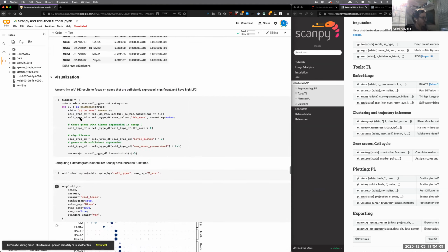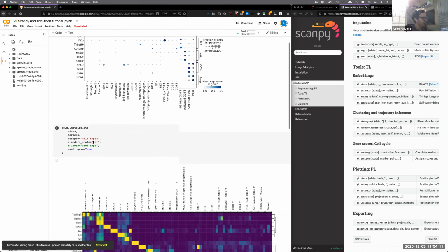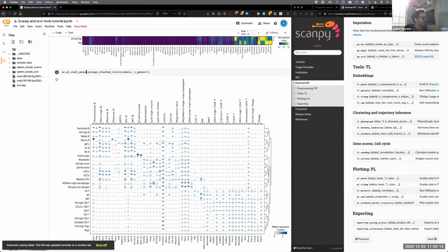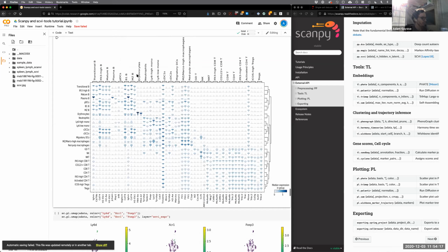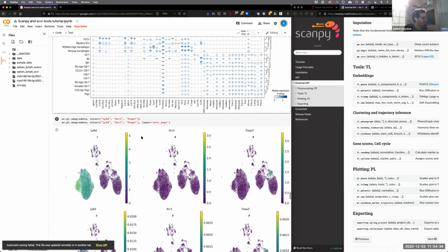I ran the Scanpy t-test behind the scenes here while we were looking at the other plots, and actually, they have a function where I can plot rank_genes_groups. Like it's plotting the output of that and taking the top 2 genes per group. And you can do these really crazy things like make these stacked violin plots. I'm not sure this is helpful for anyone, but you can do it. This particular example, I think if you had a more controlled example, it would be more helpful to look at, but this doesn't do anything for me really, but it's cool.